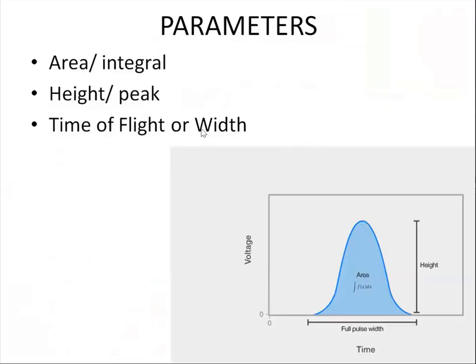see, for every signal which has been taken up by the detector, a bell curve is formed. Now this signal has multiple parameters, so this particular signal can be described by multiple discriminators.